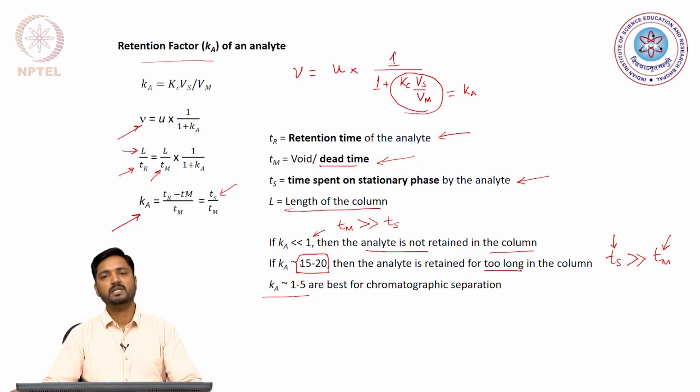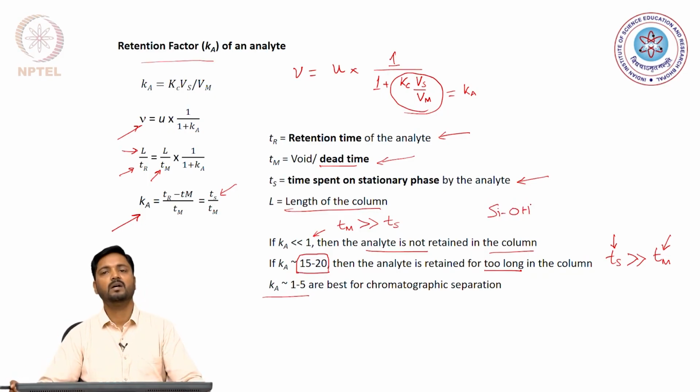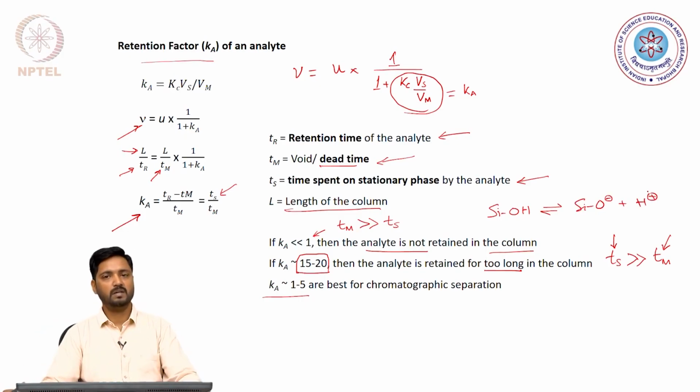We saw yesterday that it has these silanol residues, that means silicon OH bonds, which can be a source for protons at the appropriate pH, and these protons can now catalyze certain reactions which may result in degradation of our compound.